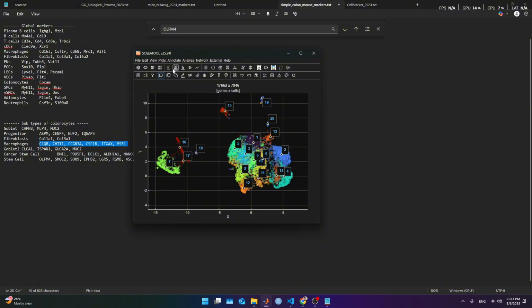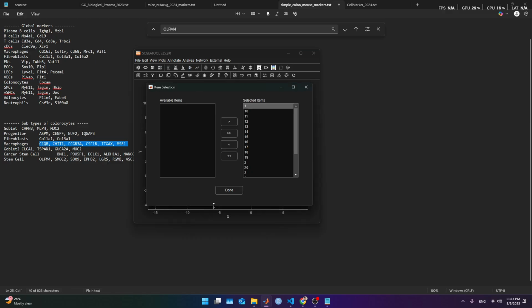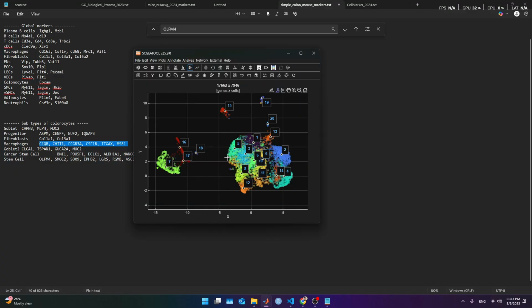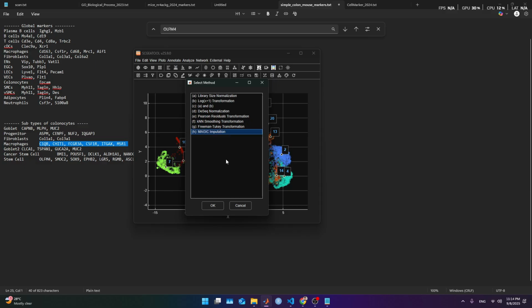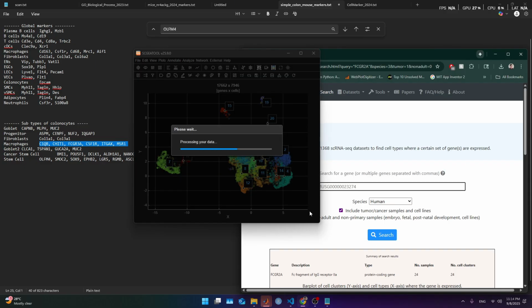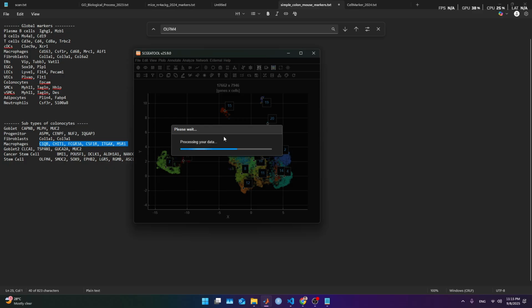And then we're gonna plot the Violin on clusters. For all of them, gene expression, paste that gene set, A and B normalization, and we let it be. And we're gonna get the markers now into every cluster, and I wanna see if all of them are lining up in the 19.